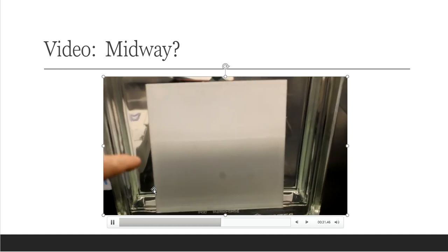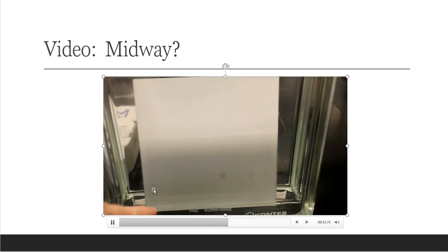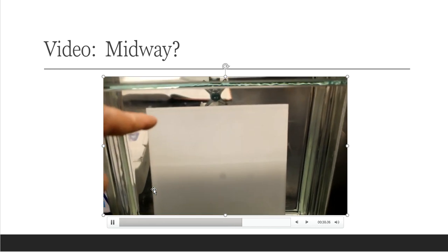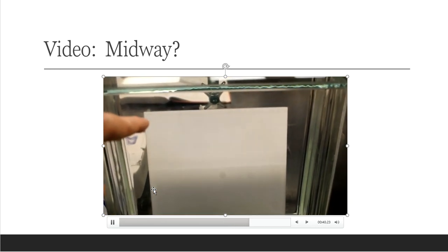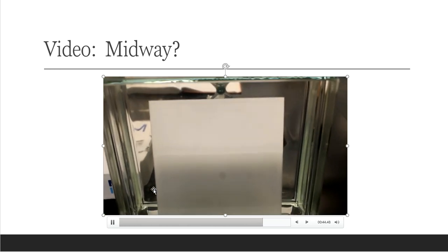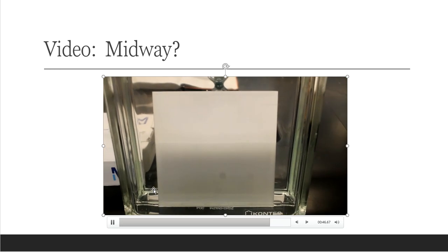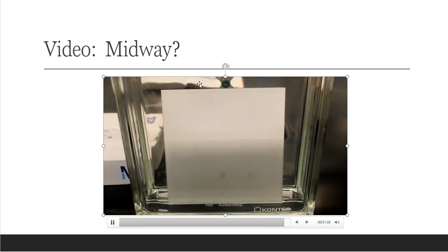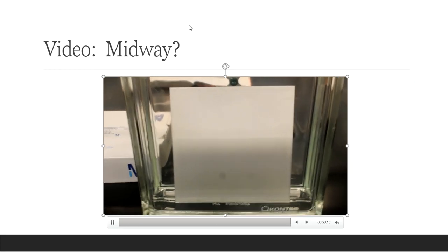So the lab directions tell me to allow this solvent to suck up the TLC plate all the way through until it gets to about 1 to 2 centimeters from the top. And that's going to take a while. So I'll just hang out and let this thing do its thing. And then I'll come back in 30 minutes or so and see how far along it's gotten.